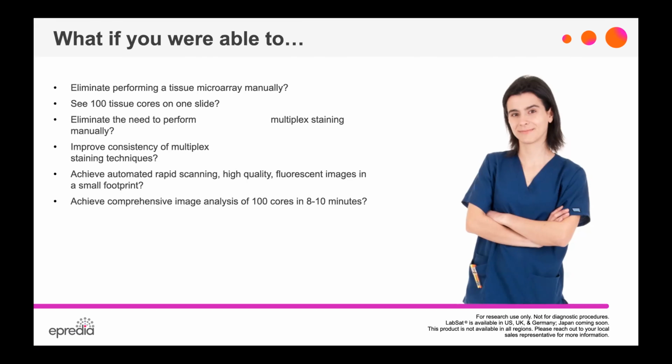It also puts them at a very precise depth level, depending upon how many sections have been taken from the donor material block, so that all of the cores are positioned in the same way. And if you do this in a manual method, it's very tricky, and you have to have a good skill set in order to be able to do this. It's extremely time consuming, so automating this is helpful.